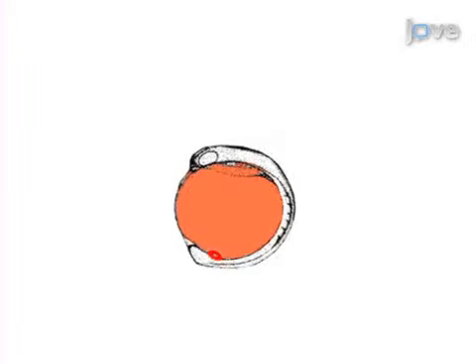Next, injected embryos that have fluorescent morpholinos only in the yolk cell and the KV are selected for further analysis.